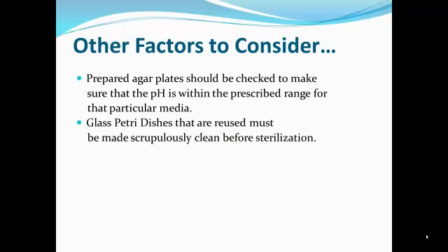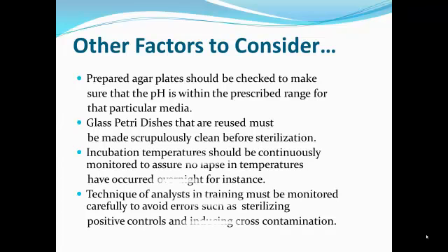Other factors to consider. Prepared agar plates should be checked to make sure that the pH is within the prescribed range for that particular medium. Glass petri dishes that are reused must be made scrupulously clean before sterilization. Incubation temperatures should be continuously monitored to assure no lapse in temperatures has occurred overnight, for instance. Technique of analysts in training must be monitored carefully to avoid errors such as sterilizing positive controls and inducing cross-contamination.